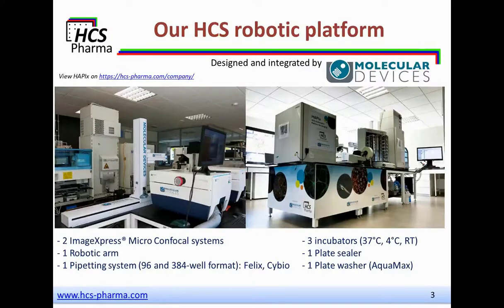On this slide, you can see different pictures of the platform that was designed and integrated by Molecular Devices, so different views. You can see the two ImageXpress microconfocal systems that we have, one on the left being thermostated for live cell imaging. One robotic arm taking the plates from one device to another.